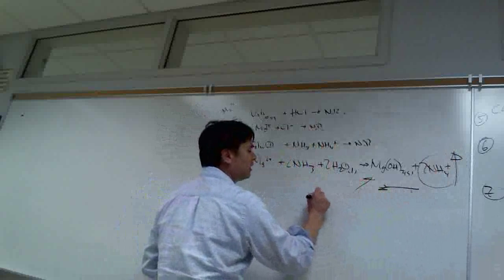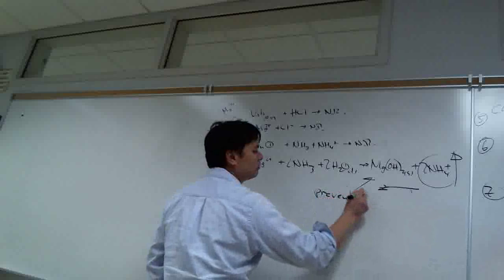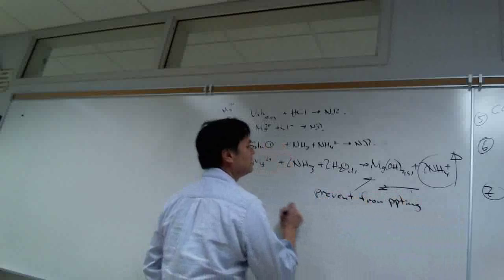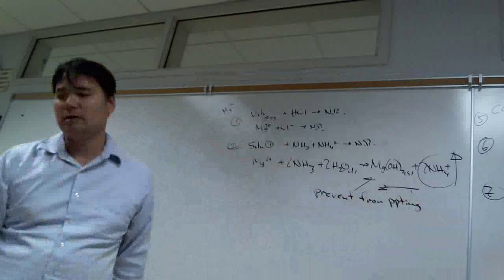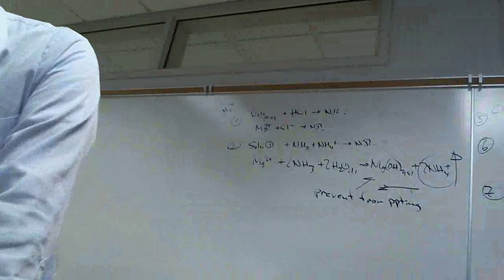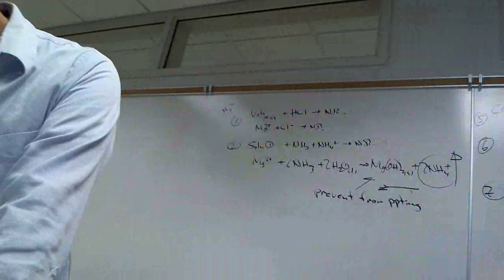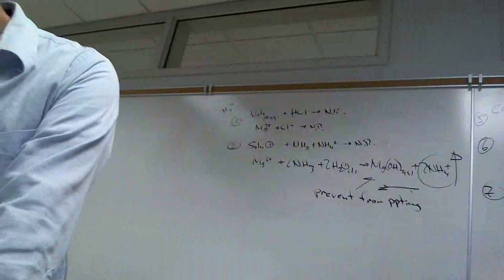we're going to prevent this from precipitating. And so what that does is it just leaves it in aqueous phase, and then we can go to the next step, which is adding ammonium oxalate.